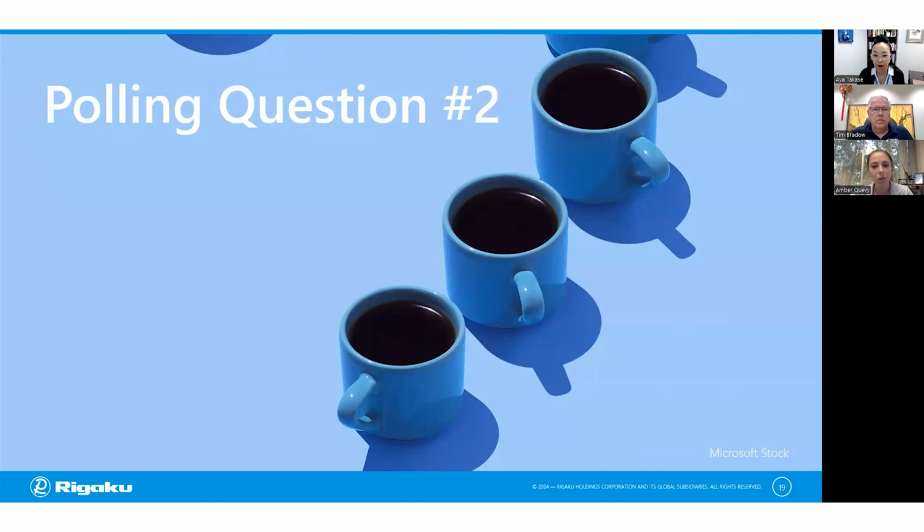So now that we've had a chance to review the two instruments, we'd like to ask another question. Okay, let me start the next polling question. The second question we wanted to ask the audience is, do you have an XRF spectrometer? We remember that some of you said that you do use XRF. You might say, yes, I have WD XRF, or you might have an ED XRF, or you might have both WD and ED XRF, or you might not have one.